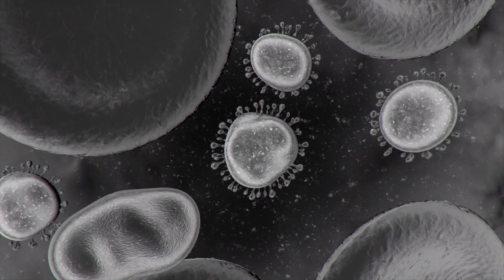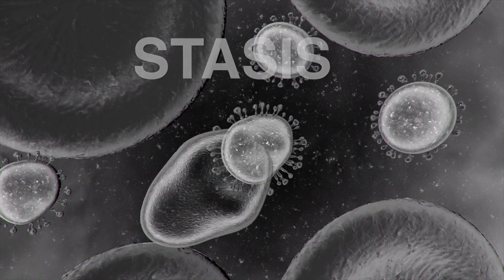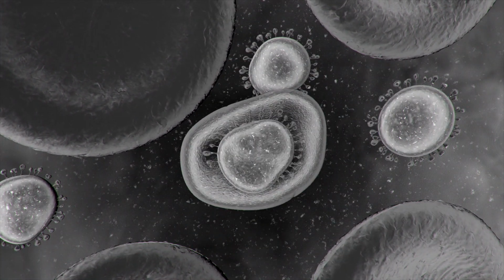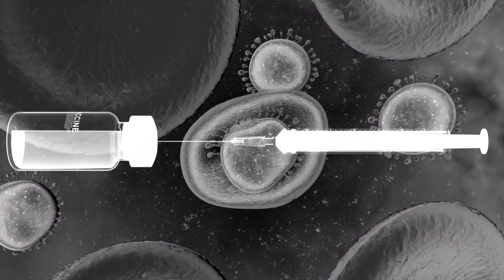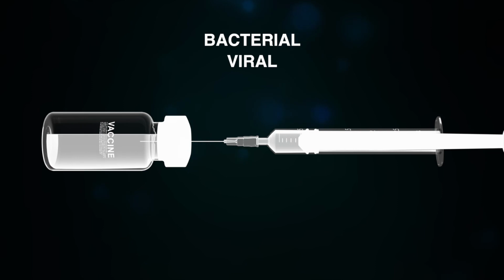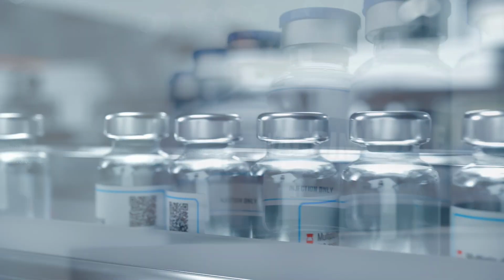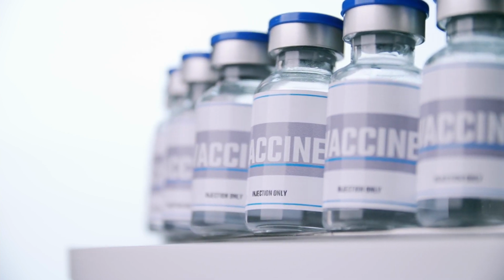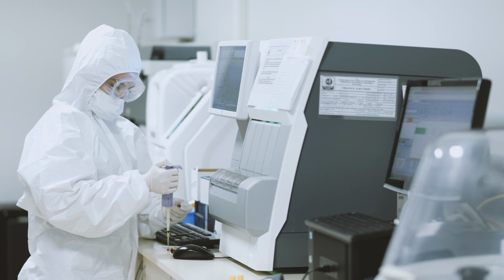The aim of a successful sterility test is stasis, which essentially means that microorganisms cannot grow or replicate within the medical product itself. There are many different types of vaccines, like bacterial, viral, and DNA-based vaccines. Regardless of the manufacturing process or raw materials needed, they must all go through a sterility test to make sure that they are safe for public consumption.